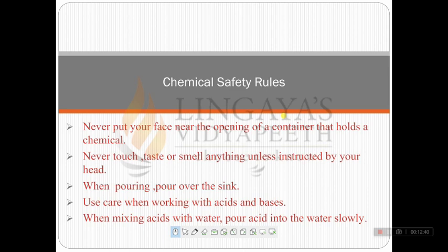When pouring, pour over the sink. When pouring the chemicals, it is advisable that you pour the chemicals over the sink so that it will not spill onto you or onto the floor of the laboratory.